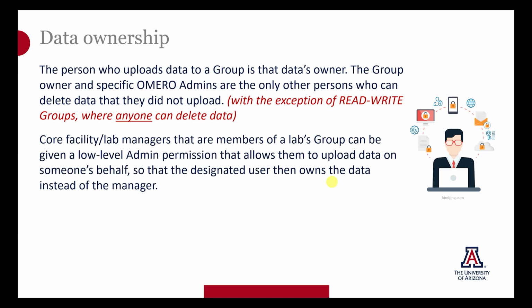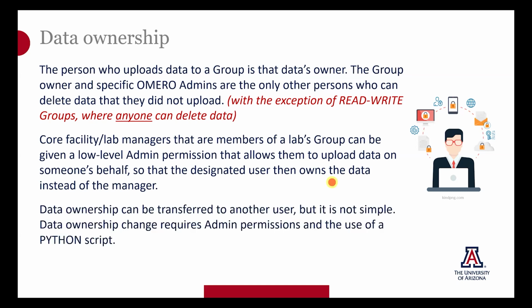We can give the core facility staff or perhaps a lab manager within your lab a low-level administrative permission, and they do need to be a group member, that allows them to upload the data on someone else's behalf. If for some reason the process isn't completely automatic, like with a Python script, then it's possible that the lab will need to pay for core staff time. But there are ways to set up folders that do this fairly automatically. Data ownership can be transferred to a different group member, say after someone leaves, but it's not simple. Doing this requires administrative permissions and a Python script.